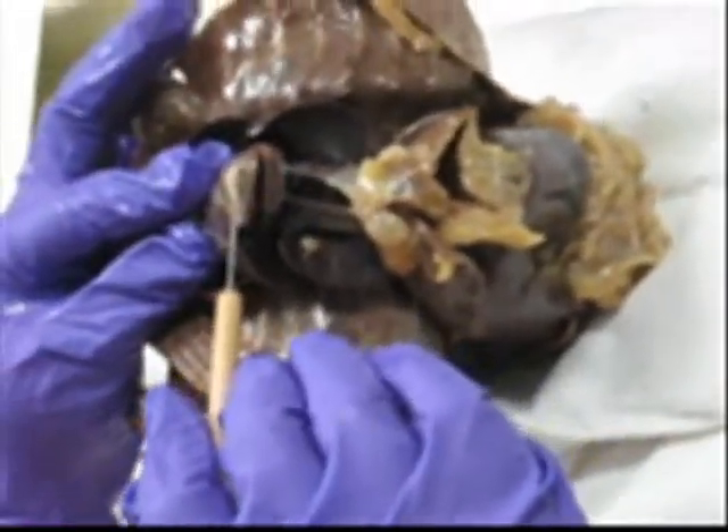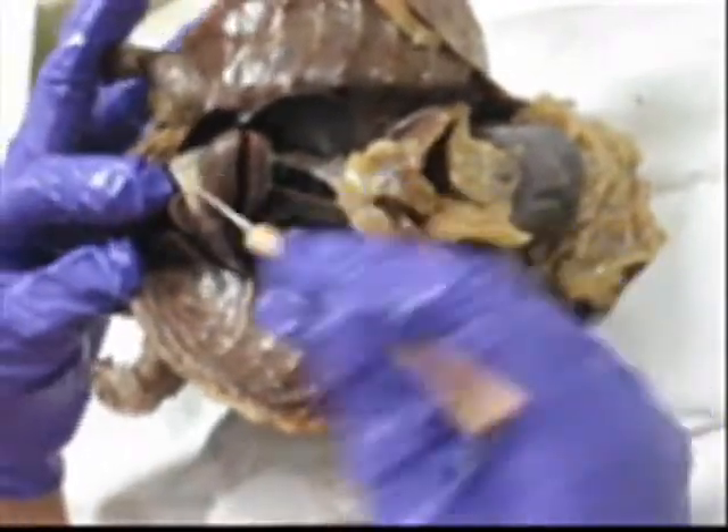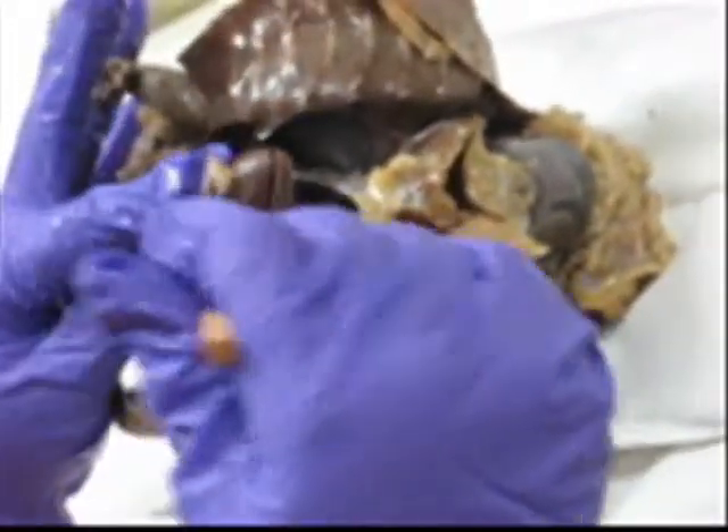Then we're going to peel back this membrane. What is this membrane? Pericardium — which one? Parietal pericardium. Great. Very tough membrane.